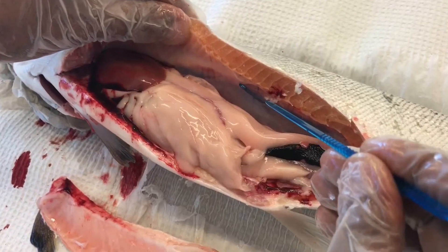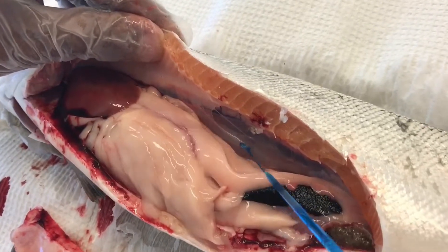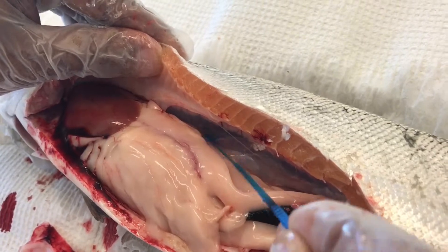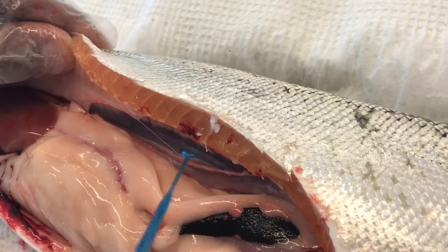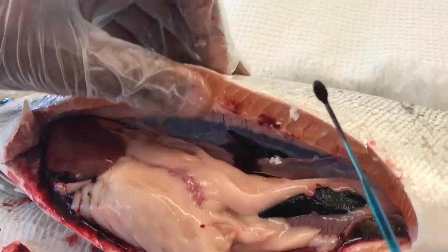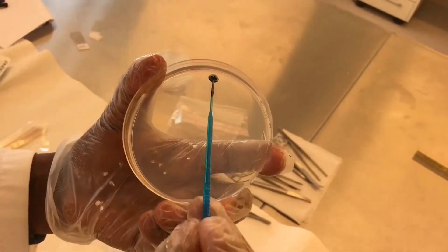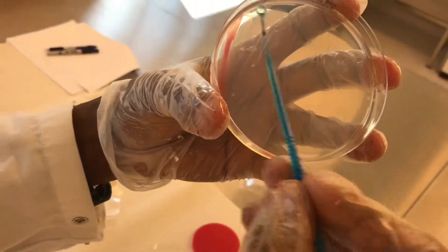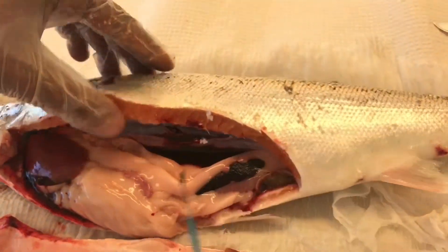Here is the kidney. Here you see the swimming bladder deflated. Along the spinal column is the kidney — the mid kidney. Insert the inoculating needle into the mid kidney and take a sample on the agar, specifically on the red agar.